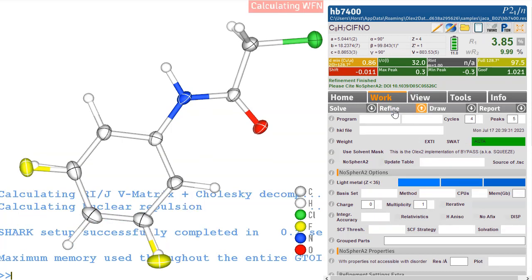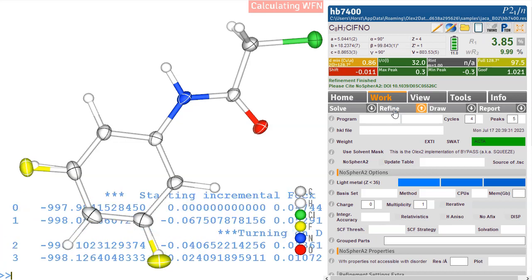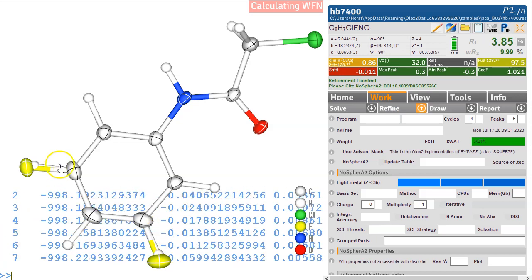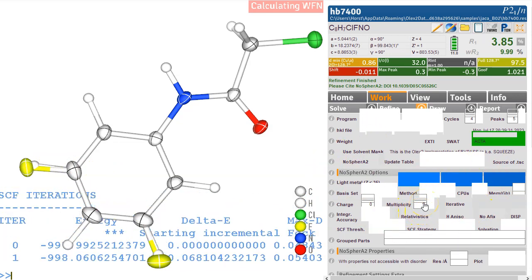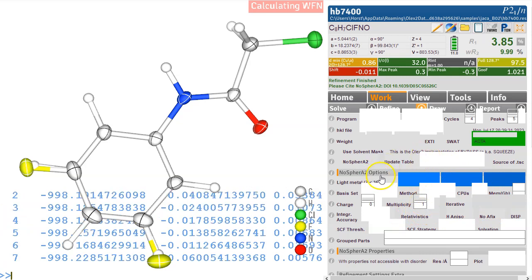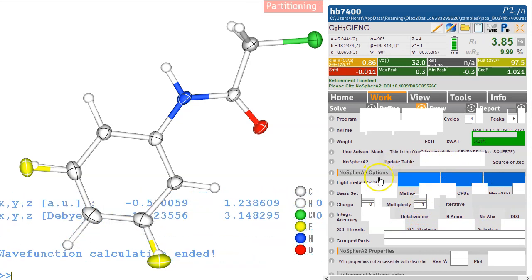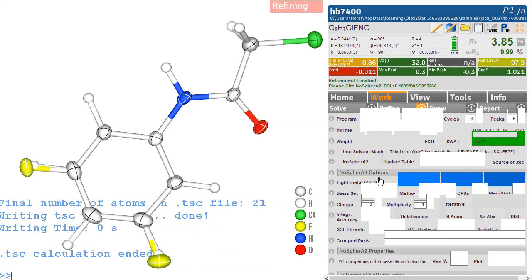Right, so it's doing the same thing again. We're refining all the hydrogens freely now, all the hydrogen atoms freely except for those two here. Now when that's done, I don't know why the GUI is getting completely messed up, that's obviously something we need to fix.